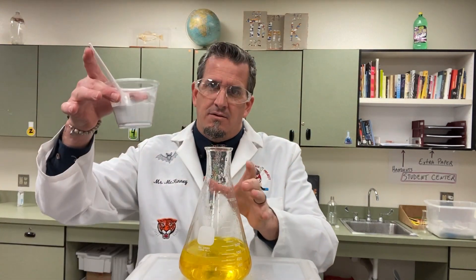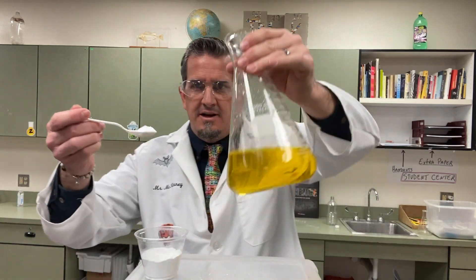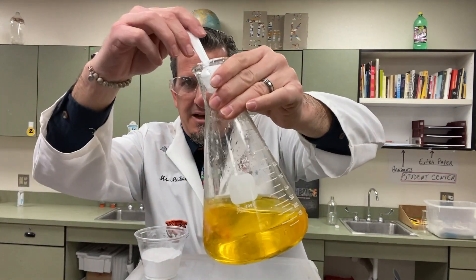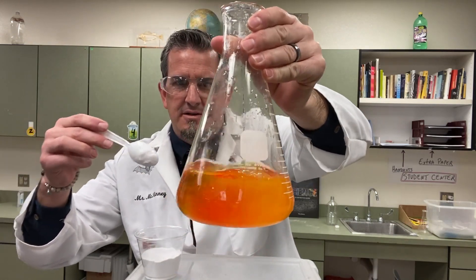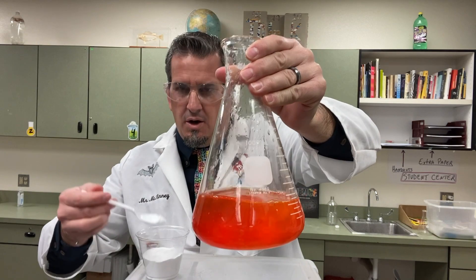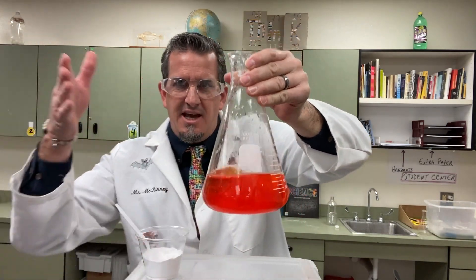And then I said, hey, what do you all think this is? After I took this powder and added it back in, you get some fizzing and then it turns back to kind of a reddish, orangish color — basically because the solution is basic again, so the phenol red turns back to pink.